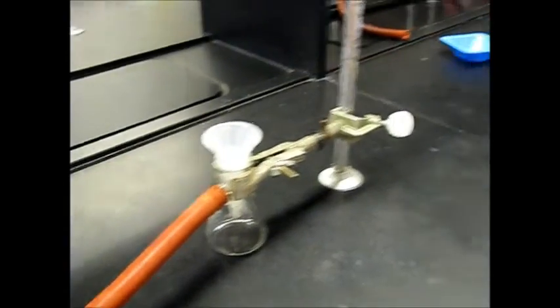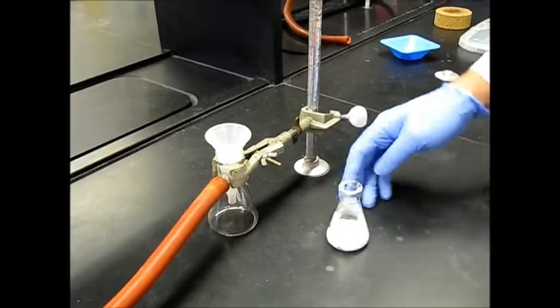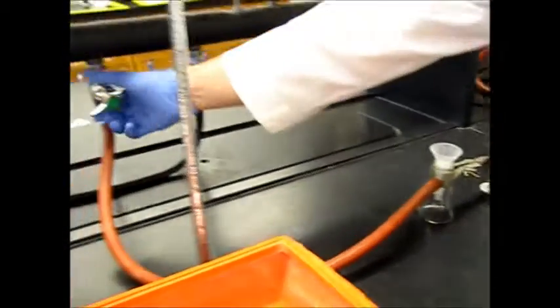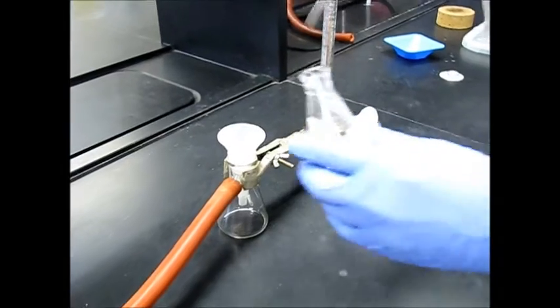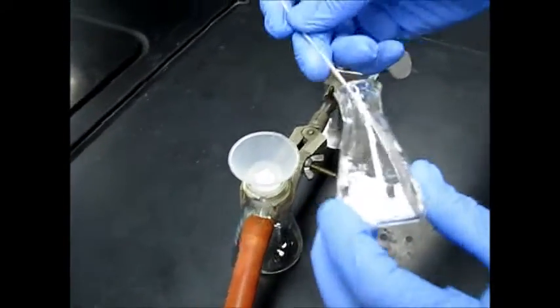Cool. So now we're going to dump all of this stuff into our little funnel. All of the liquid should come out, and we'll just have our solid up at the top. Go ahead and turn this on for the vacuum. And then we can help get all that solid out with our spatula.